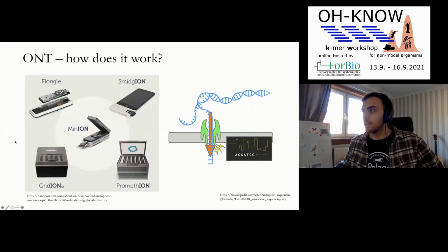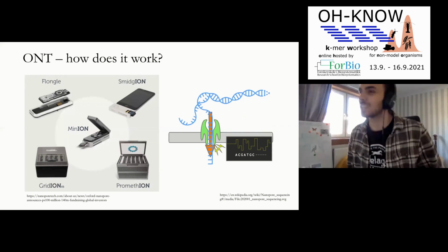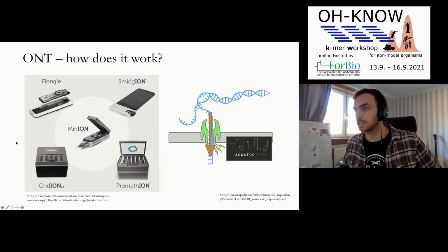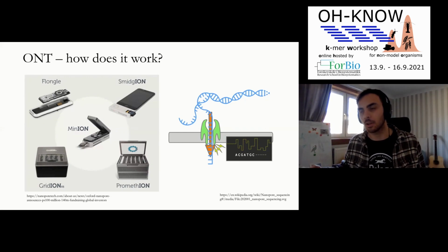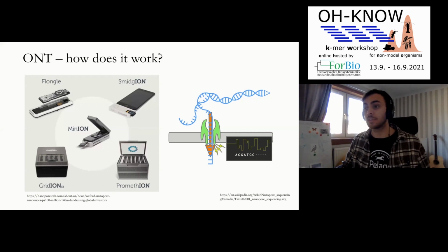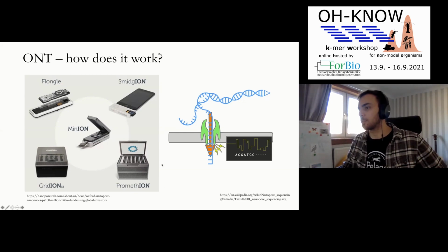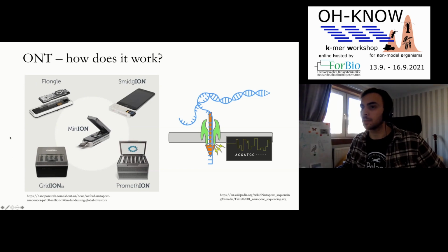Then there's Nanopore, which is, I would say, one of the most fashionable sequencing technologies nowadays. And their branding has worked very well. Nanopore have this whole host of different sequencing machines, which were, I think, initially designed to help you use them in the field or in conditions where you might not be able to house, say, a whole Pacbio machine. They're relatively far more affordable than the other technologies in terms of the machines. You can see some of them are small enough to plug into your phone. And some of them here are massive and produce massive amounts of data. Nanopore reads are much longer than both of the other technologies. They can be up to hundreds of kilobases.